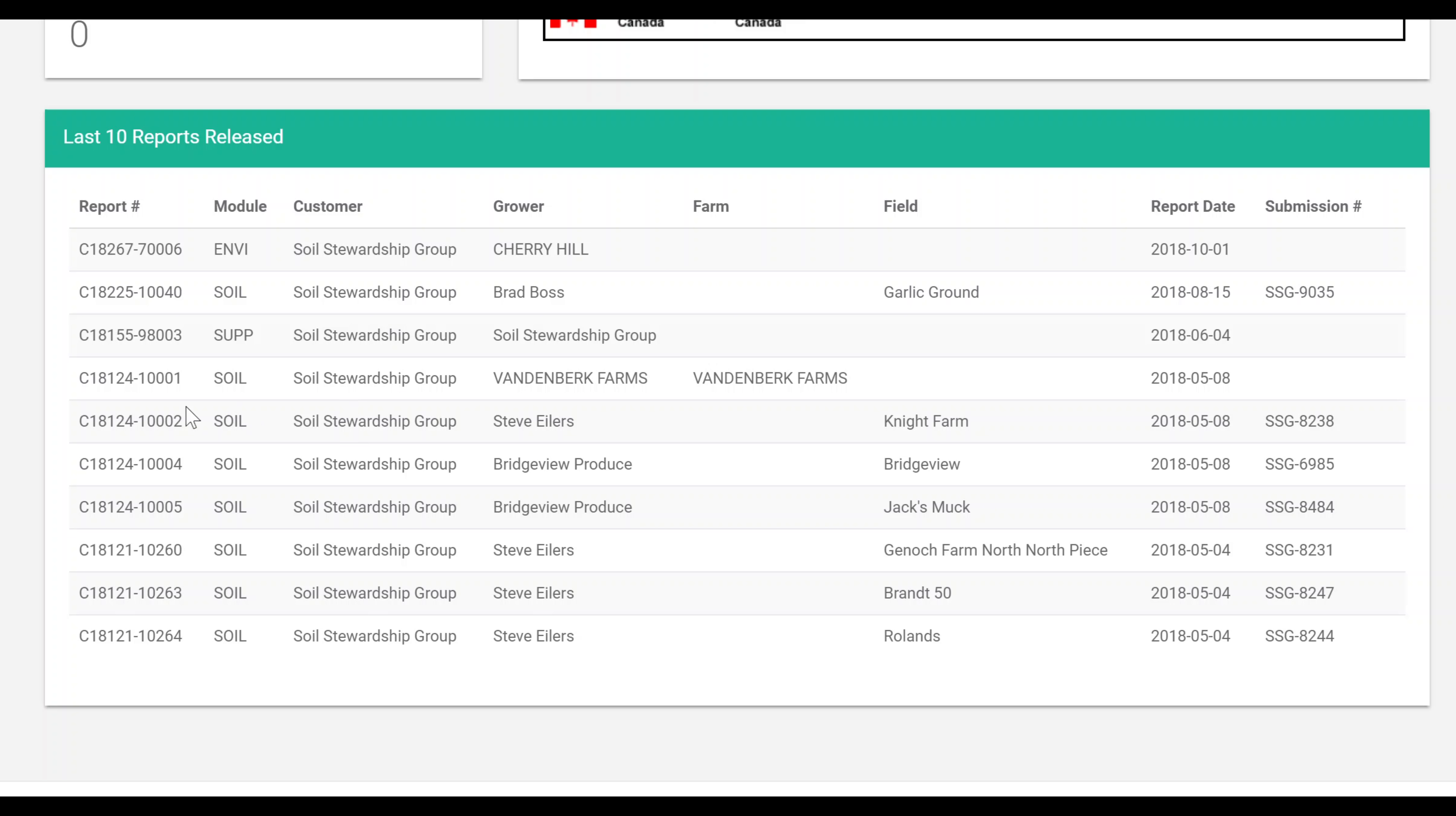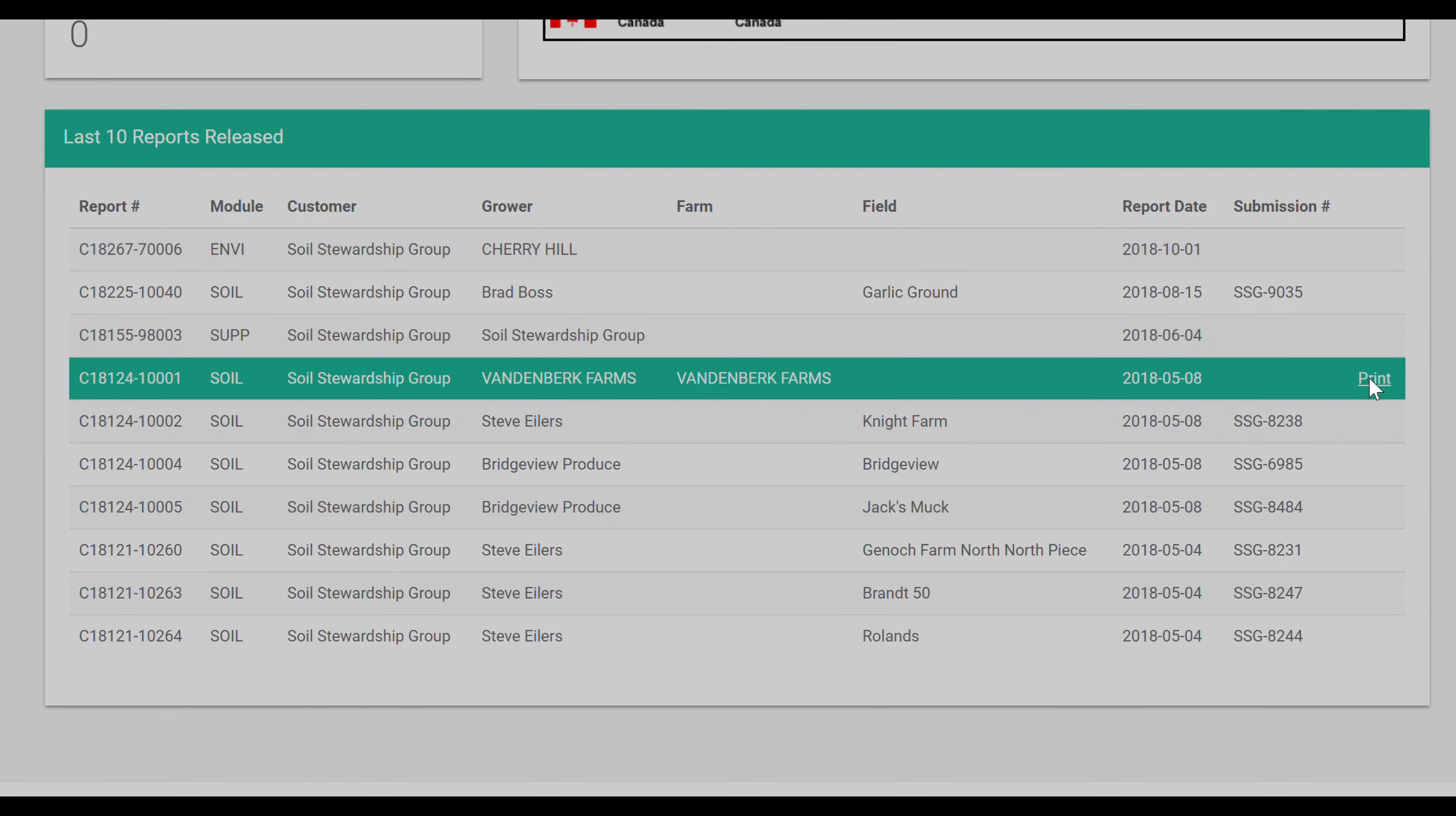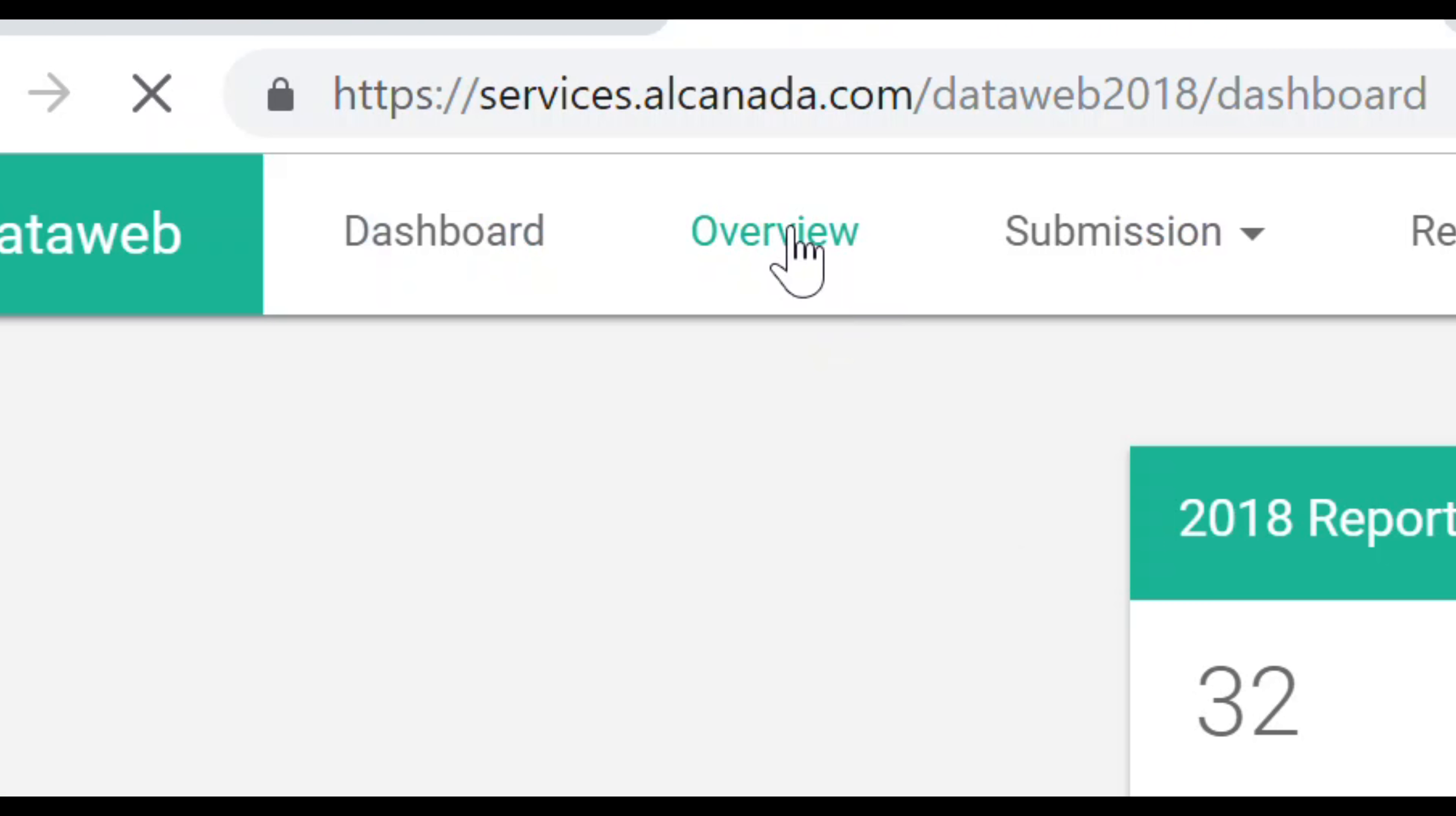It also lists your last 10 reports released which you can select and print right from this dashboard.